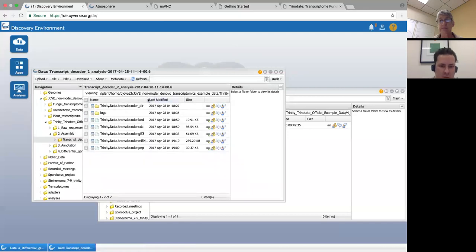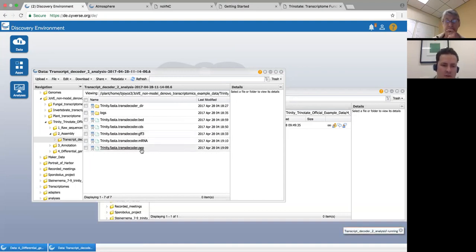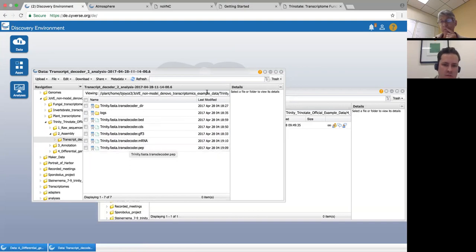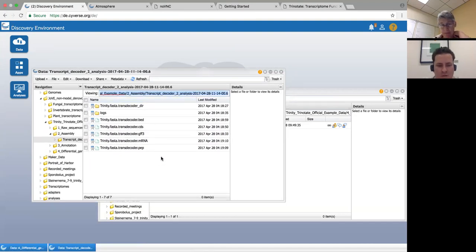Of course I've already done that. The output looks like this: it gives you a GFF3 annotation file, but it also gives you this .pep file — the Trinity FASTA transdecoder .pep — and that's what we really need. So what I'm going to do now is, because this is in the data store in the Discovery Environment, all I have to do is move this from there over to my Atmosphere instance. I'll just copy this long path that tells the computer to go into each of these folders and find me this file.